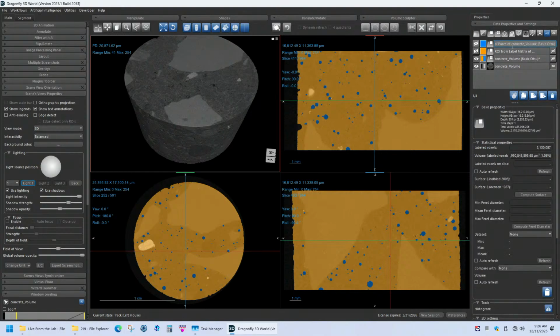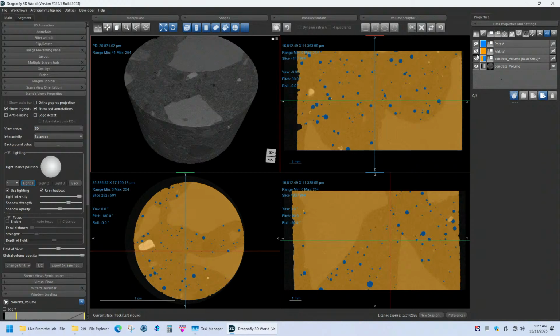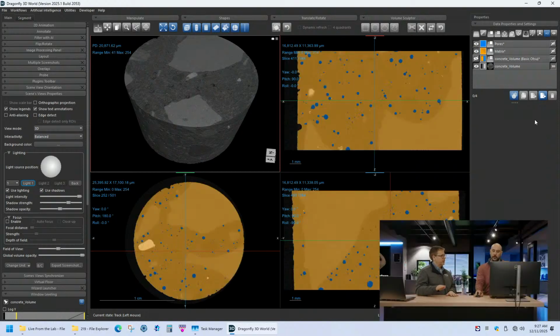And like I showed you earlier, we can change the name. Instead of that long description, we can just leave it as matrix, and pores. So now these are just identified areas of space that belong to the class called matrix or the class called pores.